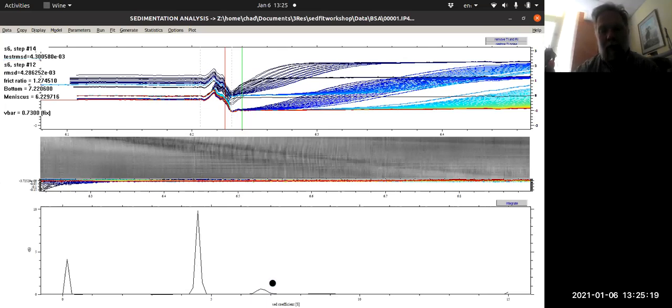When I look at the molecular weight of the second peak, it turns out it's about twice the molecular weight of BSA as predicted. You'll notice something interesting too about that, and we'll get into that in a minute. The BSA dimer is rolling in at an S value that is not twice as much as you would expect for the S value of BSA. So for this particular experiment, the S value for BSA looks like 4.6 or so. That means that you would expect the dimer to be about 9, but instead it's actually a good deal lower.